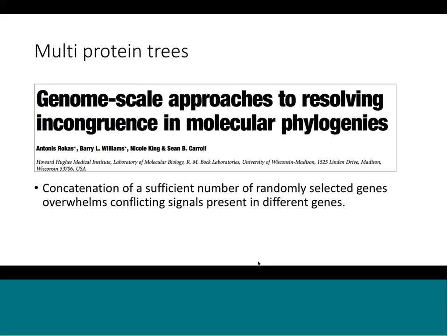But now that we have this tsunami, this cornucopia of bacterial genomic data out there, researchers are now going for a multiple protein approach, or really a multiple proteome approach, to try to take not just tens of genes, but thousands of genes and stitching them together and building phylogenies based on either the nucleotides or the amino acids behind those.